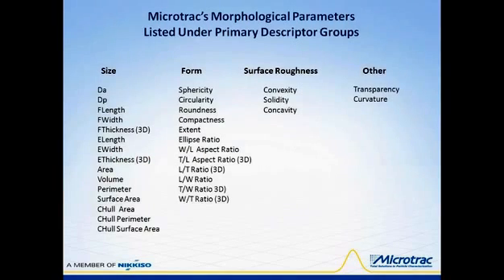Except for image analysis, all other online particle characterization technologies report only one parameter, which is size as equivalent spherical diameter, and they do not measure every particle individually to get high resolution, as image analysis does. This is the set of 32 parameters that Microtrac reports for its product line. Rather than go into each in any detail, I'll describe in 4 general terms what they measure.